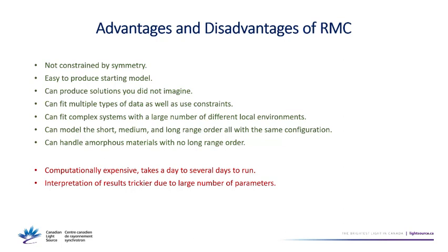But yes, it's a huge parameter space, and you don't get a unique solution at the end. There's probably millions of different configurations. And when it's finally done, it's still moving. It's switching between essentially equivalent configurations that have the same statistics, the same bond length and bond angle distributions and so on.